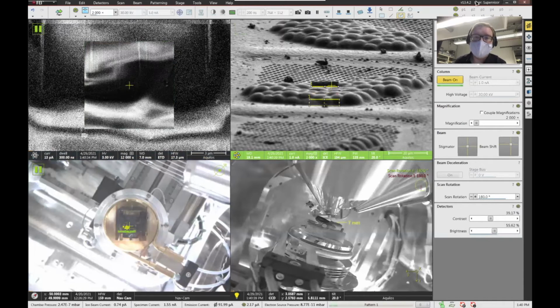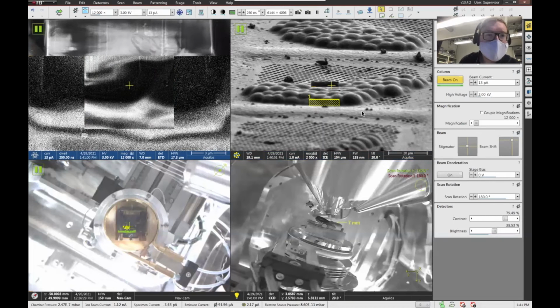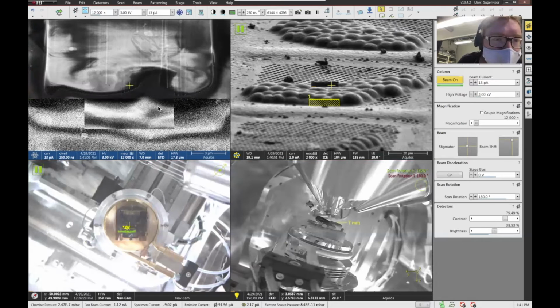There's sometimes remnants because the AutoScript clear pattern function sometimes has weird hiccups, but this pattern here on the bottom, don't panic. It's not going to destroy your sample. It's not actively milling, it's simply there in the visualization. And then we already see an image coming through of thylakoids that you see in this, a little bit of other features.